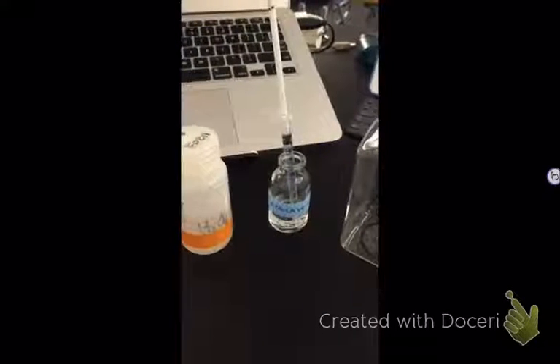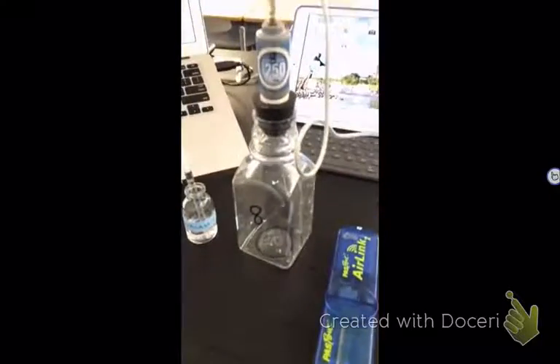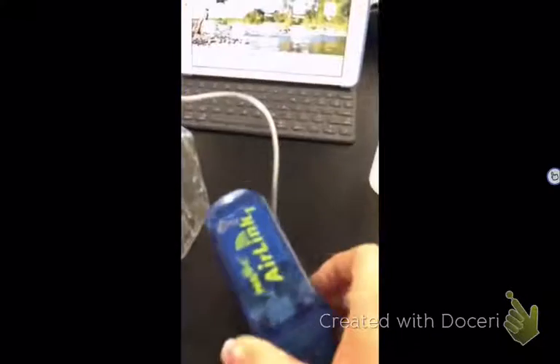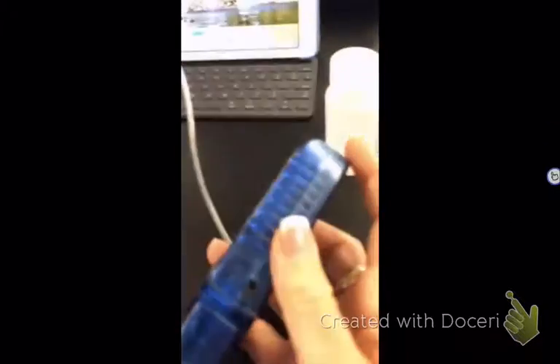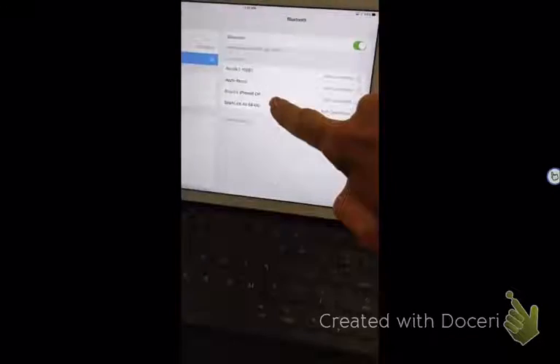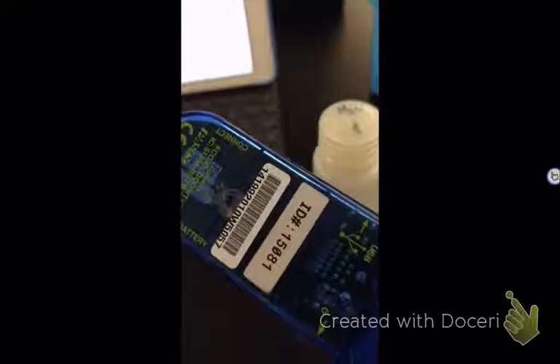Catalase will be your enzyme, and the hydrogen peroxide will break down into oxygen and water in your reaction chamber here, and you'll have an oxygen sensor connected here. As you watch this video, I show you how to connect it by Bluetooth, which some of you probably intuitively would know, but I'll show you what the software is on the iPad and how you link it to your iPad and how to use and set up a graph and all of it. It's a 4-minute video, so you can see here I'm showing you how to do the link, and I'll show you the app that's on there. Watch that 4-minute video so you know how to do it.